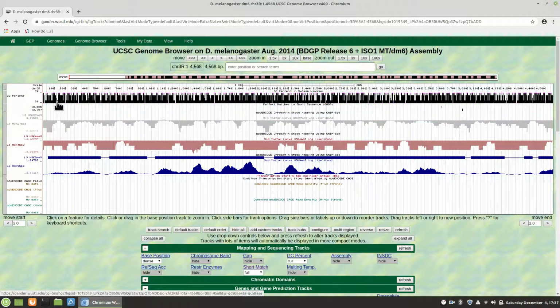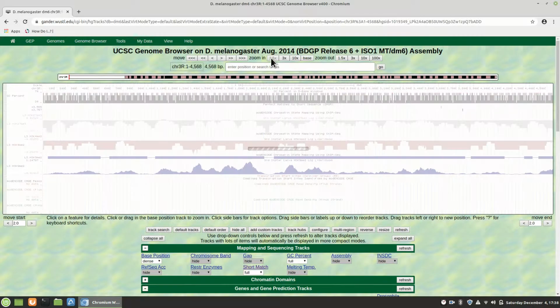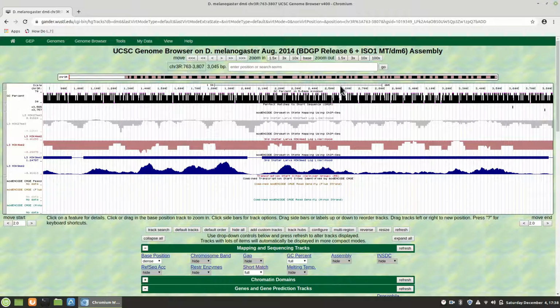No, you don't see anything along here. Oh, yes, you do. Right here. It's just we're not zoomed in enough. So be careful about that. So let's zoom in a little. Hopefully it stays on there. Yes. So here is our perfect match. So GAGA, and here we have one right there and right there. So make sure that you understand how to use this.